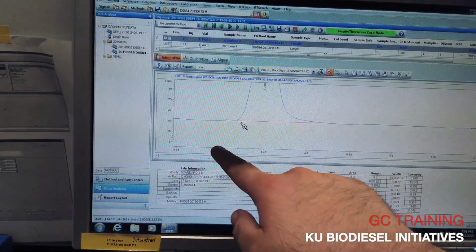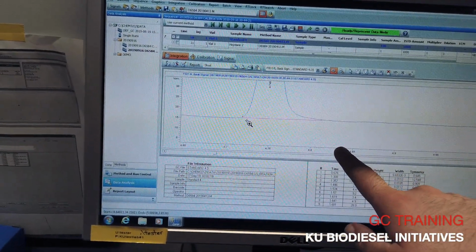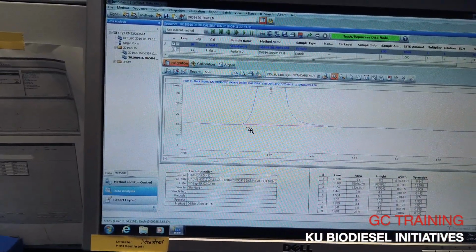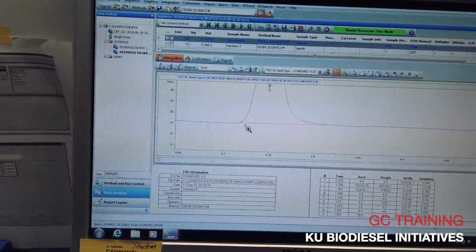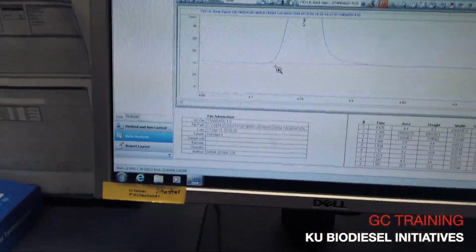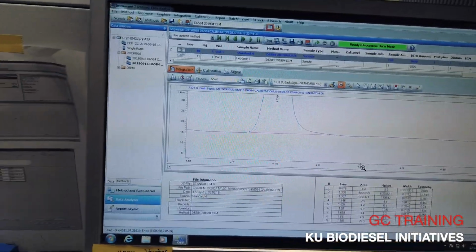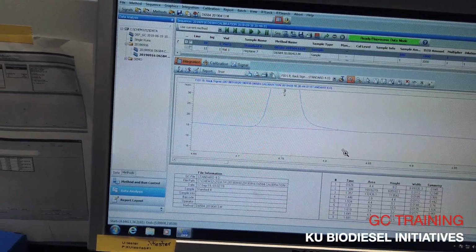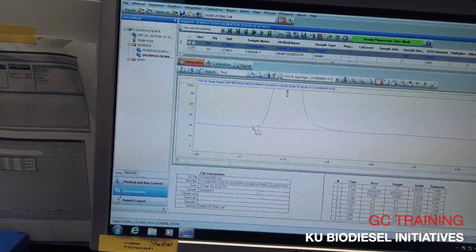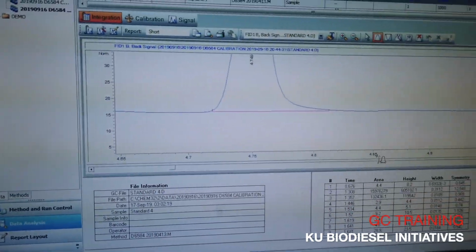So you basically have to zoom this in until you have enough resolution in your tick marks to be able to actually get it. I'm never going to be able to get it out to 3 units, but if I can get 4.71 to 4.85, then I'm going to call that good. So that's 4.85, and then this is apparently fine. So I'm just going to go ahead and go from here to roughly here.